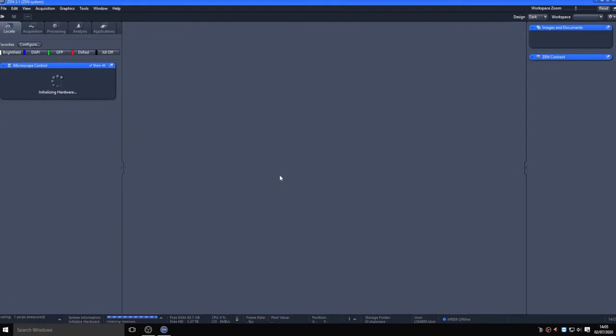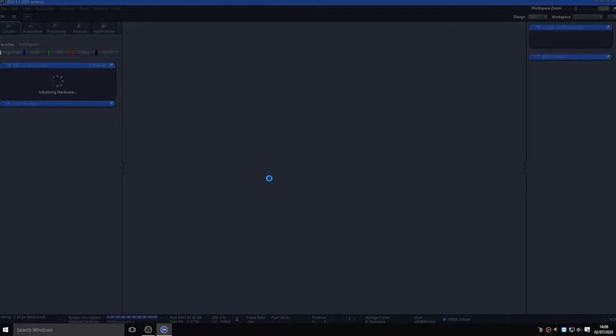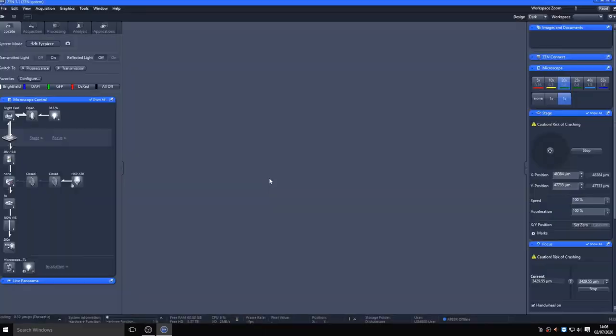Once ZEN starts, select system and the microscope will initialize. At this point you will be asked to calibrate the stage. Please do so as this will improve accuracy in tiling experiments, but make sure that no sample is on the stage and that there are no obstructions during the calibration. Once calibration is finished, you will have access to the control of the microscope.